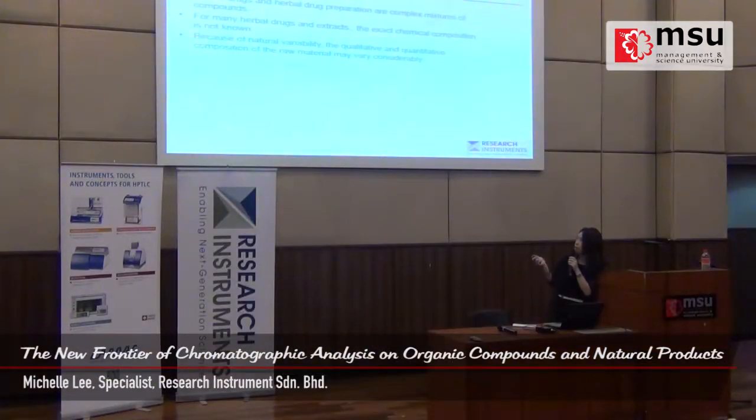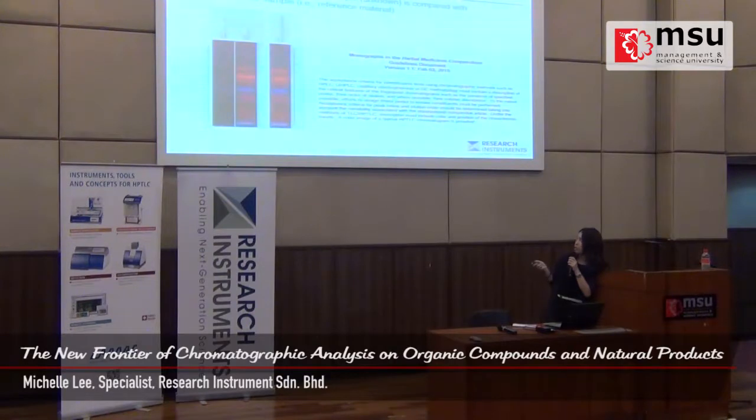So that's the reason why HPTLC is really good for natural products, because they are really complicated compounds. And this is just to show you, as I mentioned, the monograph. This monograph is like a document where, for some plant materials, they already share with you what the fingerprint looks like and all the information. So it's just a comparison: you can compare your sample fingerprint to the reference, or to the standards that you are looking at.